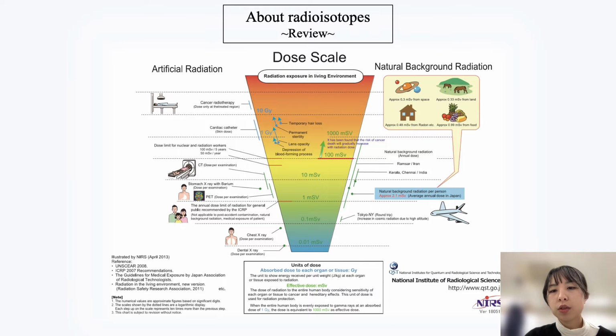When you fly between Tokyo and New York, you are exposed to cosmic rays, which are almost 0.2 millisievert, and at about 100 millisievert, an increase in the incidence of cancer is detected statistically. Radiation users are more likely to be exposed than the general public and are required to control the exposure not to exceed 50 millisievert in a year.